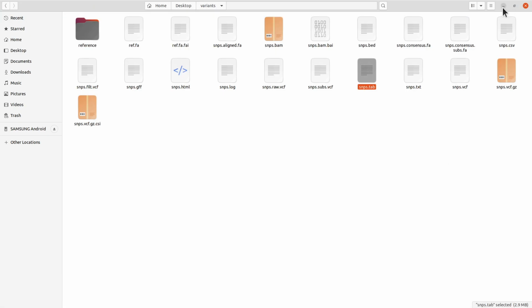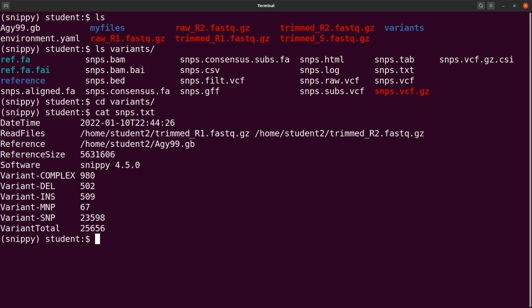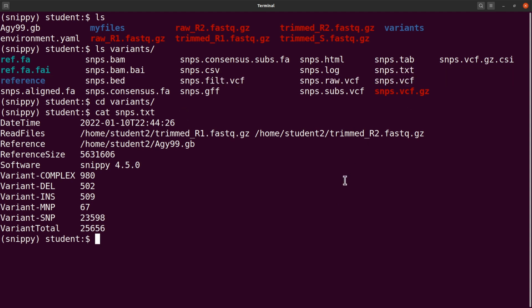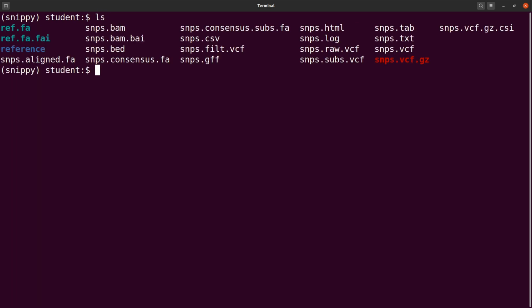Okay, so it's very, very important. Before we even look at using Python for some of this exploration, let's look at how we can use Linux to do some quick surveys. We already started with it by using the cat command here to display this. Let's say you have the VCF file here and you want to get the number of variants. With some Linux commands, you can do it. So let's just do it. Let's clear the screen first, do an ls, and then proceed.